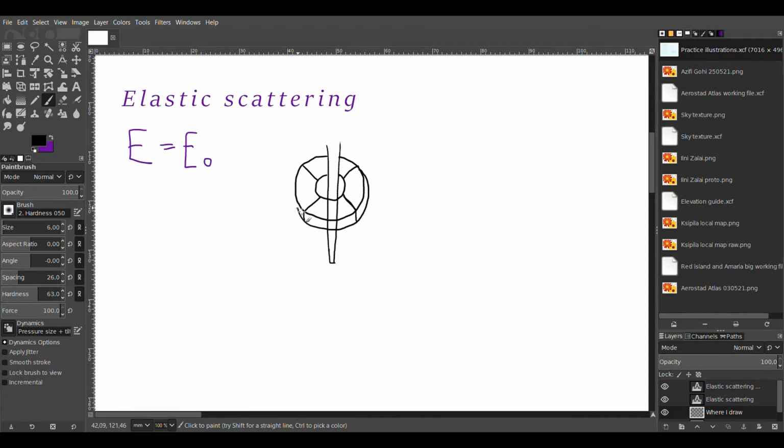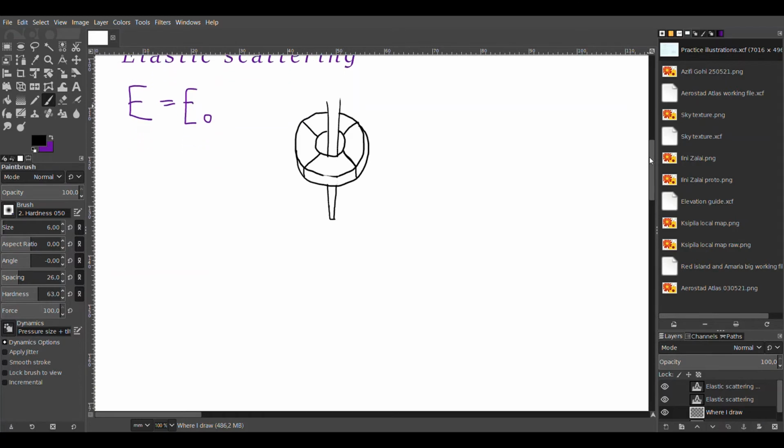But this has some quite useful properties, which I can get into a bit later. So yeah, you have detectors there. You can also have just one detector or 2 detectors. That's fine. It does the work as well.